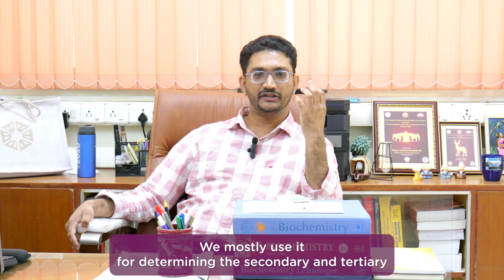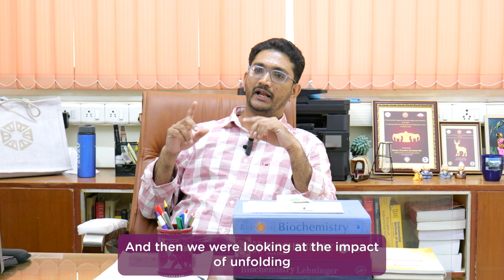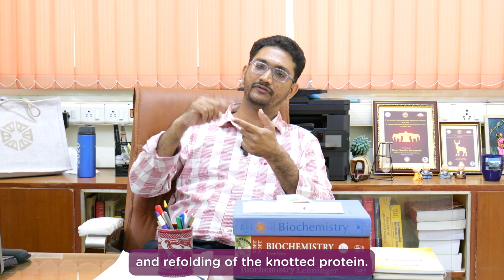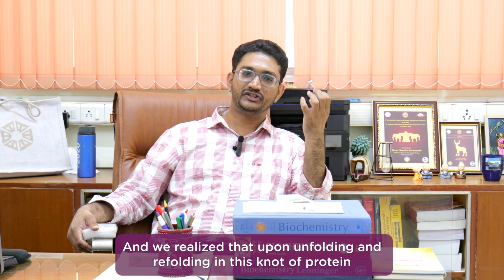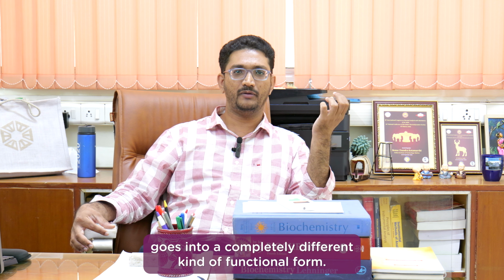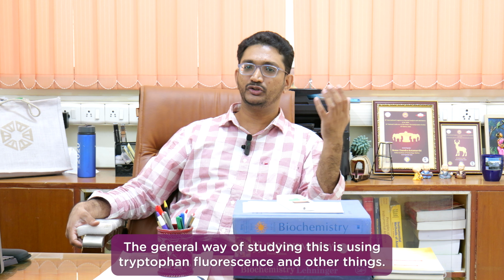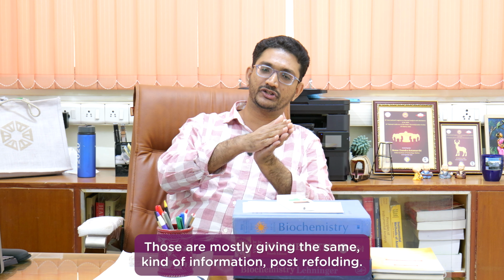We mostly use it for determining the secondary and tertiary structures of proteins. We were working on a knotted protein and looking at the impact of unfolding and refolding. We realized that upon unfolding and refolding, this knotted protein goes into a completely different kind of functional form. A general way of studying this is using tryptophan fluorescence and other methods, but those were giving the same kind of information post refolding.